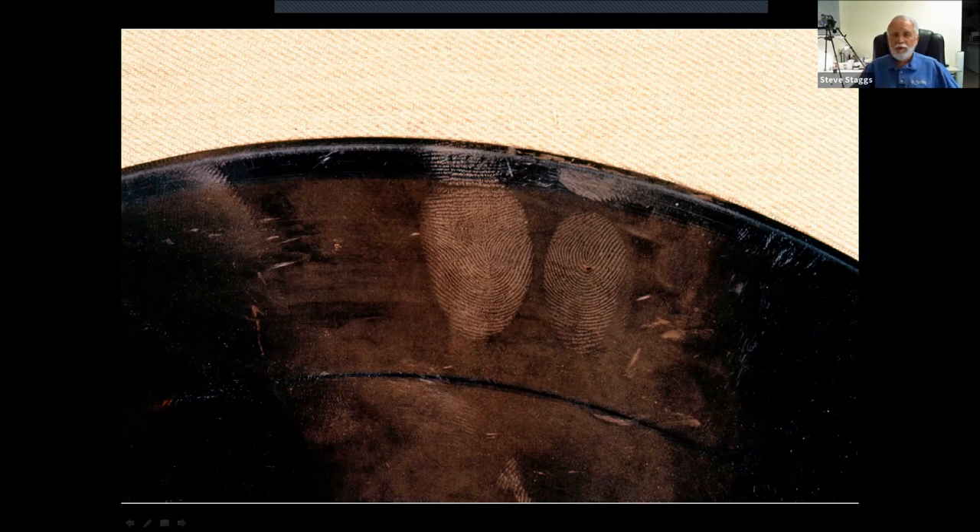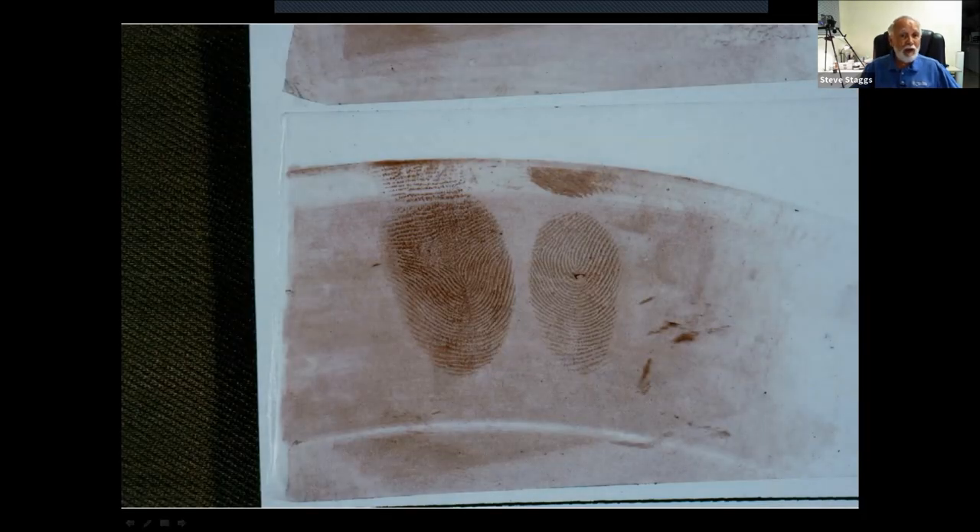As we are dusting, we will find a latent print. What you see on the screen are two latent prints that have been dusted with a powder. That helps us to see the detail because that powder sticks to the moisture and oils. Following that, we will lift that powder using fingerprint tape and then put it on a backing card. That's how you do it — pretty simple.